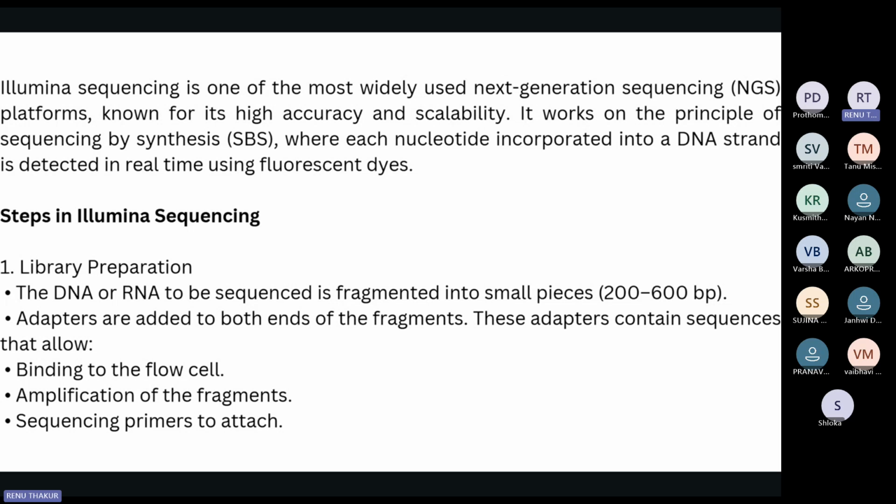Let's look at Illumina sequencing in detail. Okay, so the steps in this sequencing are a little bit complicated. So I'll be showing you a YouTube video as well now, because if we can't visualize this, it'll be really difficult to understand. The video will be going on, and I'll be explaining parallelly as well. Okay, so I'll just split my screen into two. Just give me a few minutes.